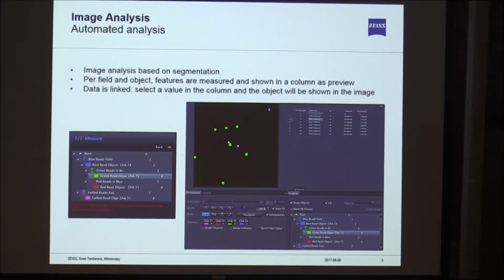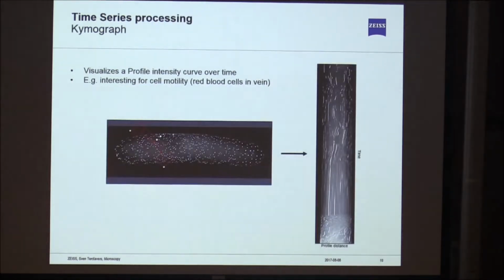Similar to the interactive measurement, which is manual handling, you also have access to automated analysis. Now, this is only available on the computers in the corridor or on the systems that you're working on. With automated analysis, you can create your own script for image analysis and then have your images, or hundreds of images, analyzed in batch automatically. Here I would like to refer to the previous talk, which is online on YouTube somewhere, I have no idea where. You can ask Doug for that, or just pass by and we can help you further with that as well.